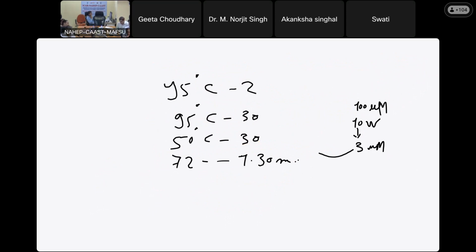Okay. Now your PCR looks like this. No, you don't need the final extension. Sorry, 35 cycles. 35 up to 50 cycles. 1.30 minutes. So you need 35 cycles.